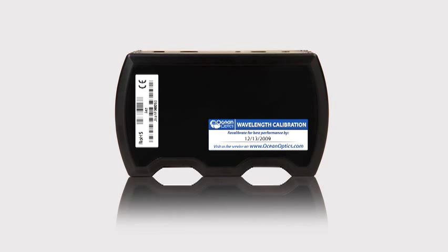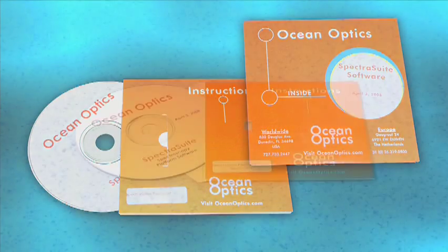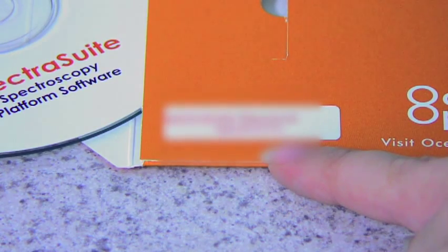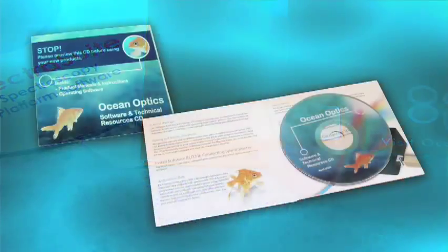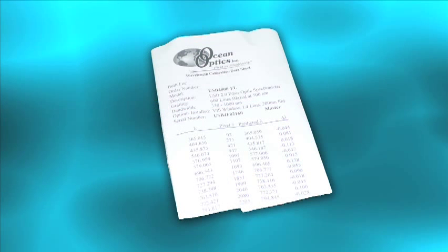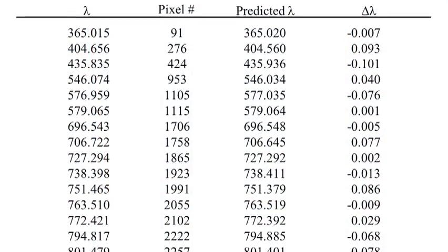If you included Spectra Suite software with your JAZZ purchase, you should have also received two CDs. The orange sleeve contains your Spectra Suite software. Flip the sleeve over to find your Spectra Suite password. You'll need this for software installation and for updates, so it's a good idea to keep it handy. The Technical Resources CD has operating instructions for all Ocean Optics products. JAZZ comes preloaded with wavelength calibration coefficients in an EEPROM, but we still provide a hard copy wavelength calibration sheet — save this in a safe place in case you need it later.